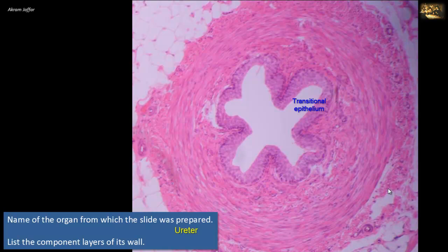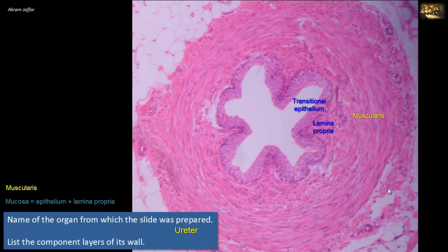The wall of the ureter is formed by mucosa — represented by the epithelium and lamina propria, a layer of dense irregular connective tissue rich in collagen and elastic fibers — then the muscularis, formed of two layers: an inner longitudinal and outer circular layer. In some sections, another outer longitudinal layer may be seen, especially in the lower third of the ureter as it approaches the urinary bladder. Contraction of these smooth muscles results in folding of the mucosa, creating the star-shaped appearance of the lumen.